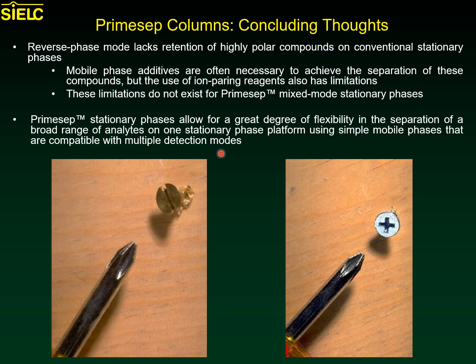And so if we return to the metaphor at the beginning of choosing the appropriate tool for the job, instead of having to use a flathead screw to hold this board in place, one could more appropriately choose a better tool, in this case, the crosshead or Phillips screw that can go more purposefully with the Phillips screwdriver.